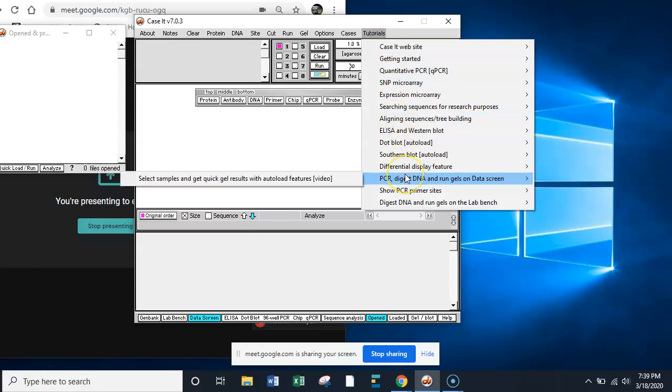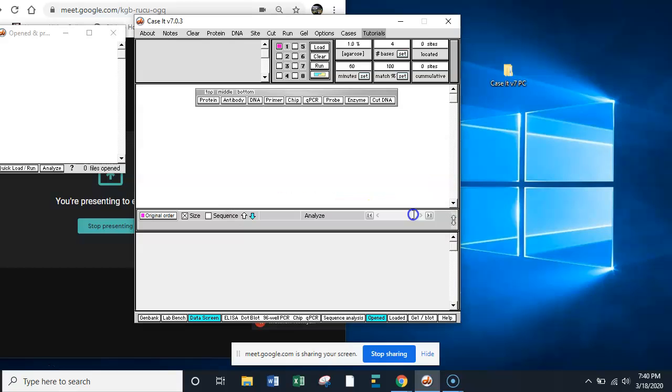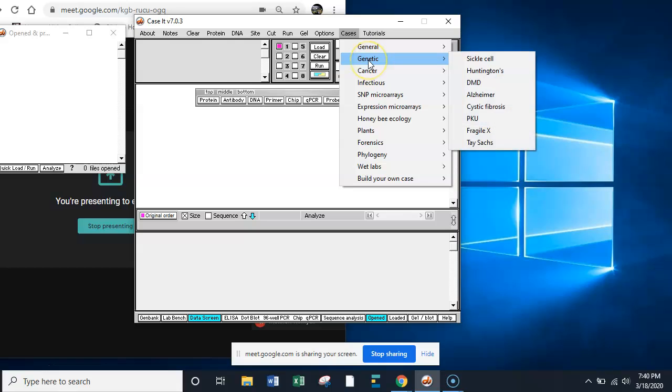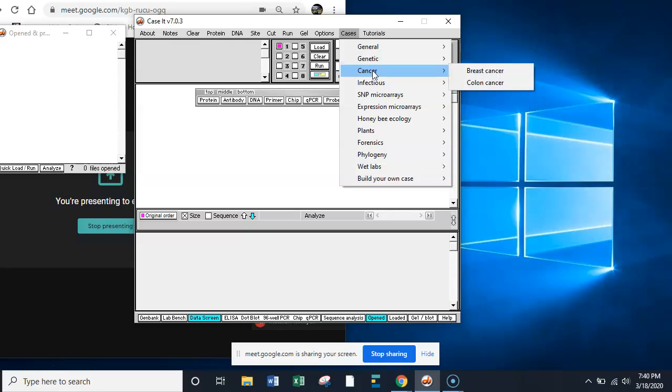The one we're doing now is PCR digest DNA, and you click over there and you click on that and a video will show up. Hopefully you've watched that already. In here it tells you what all the different cases are. So there's a bunch of genetic disease cases. So if you want to go read about them, you would go read about them here.